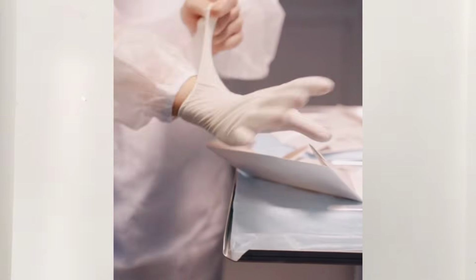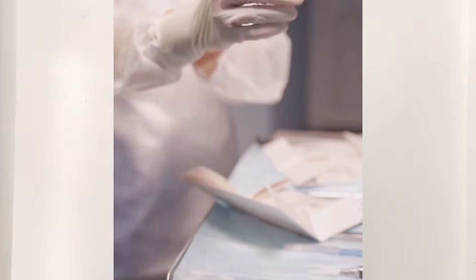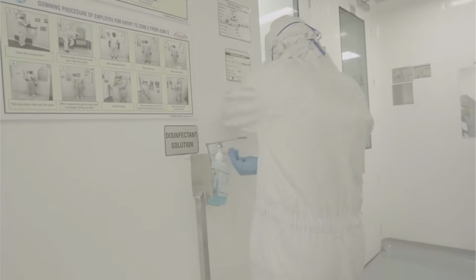And the last method, personnel monitoring. As we discussed earlier, filling operations must be performed in the grade A zone only. All personnel entering the grade A area for filling activities must perform personnel monitoring. Samples are collected from personnel at predefined locations such as gloves, forehead, belly or some other locations. This will vary based on the organizational SOP.